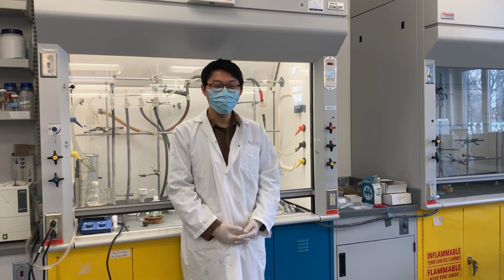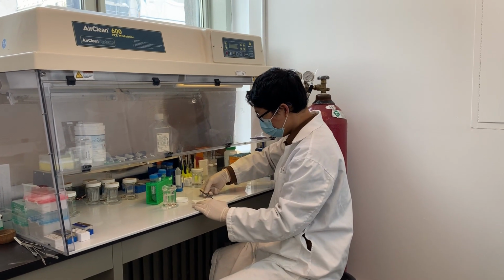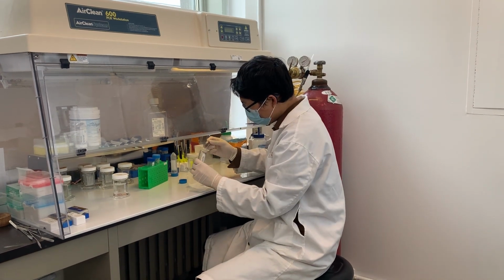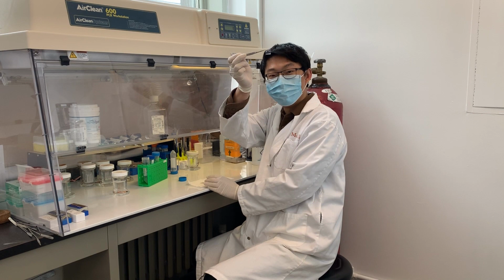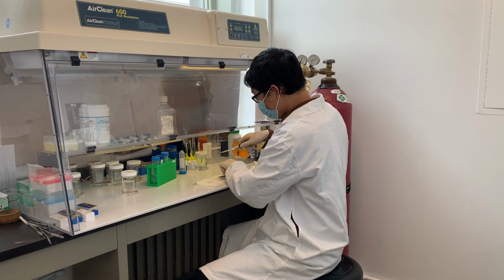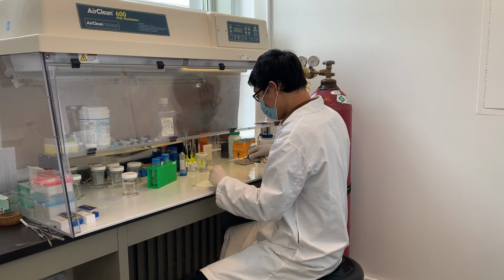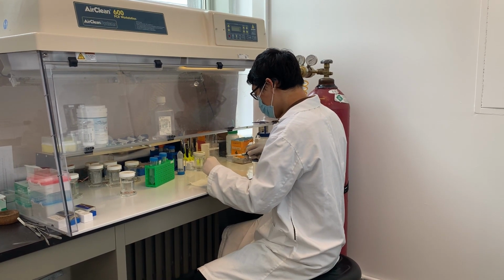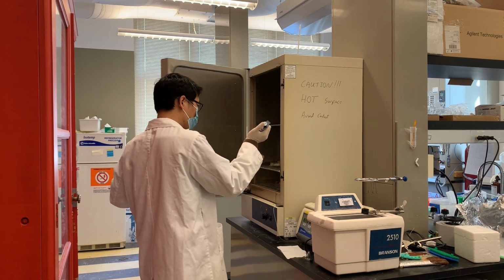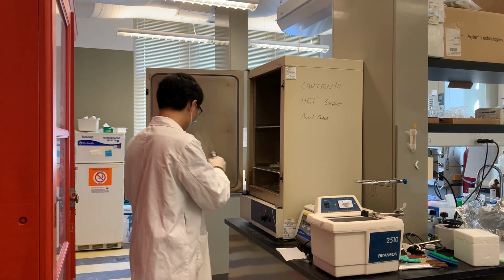And now I'm going to show you how to test these triplet state quenchers with a single molecule experiment. We first make a coverslip. We grab a piece of glass slide, which was cleaned by piranha solution and acetone before. Then we grab a piece of silicone spacer, which is used to create the chamber for our single molecule experiment, and we dry them all with nitrogen gas. Then we put the silicone spacer in the middle of the glass slide and inject PEG solution on it. Now we put our slide into the oven and incubate for some time.